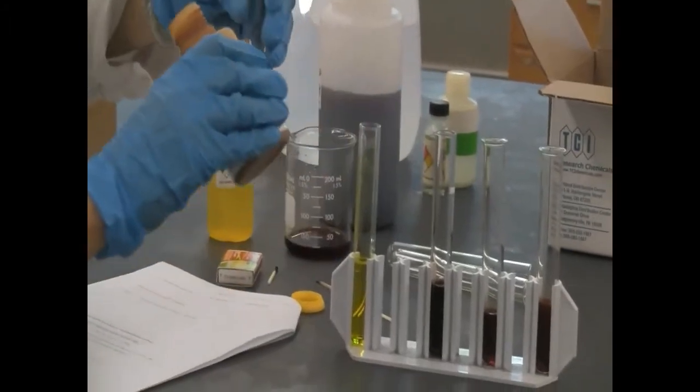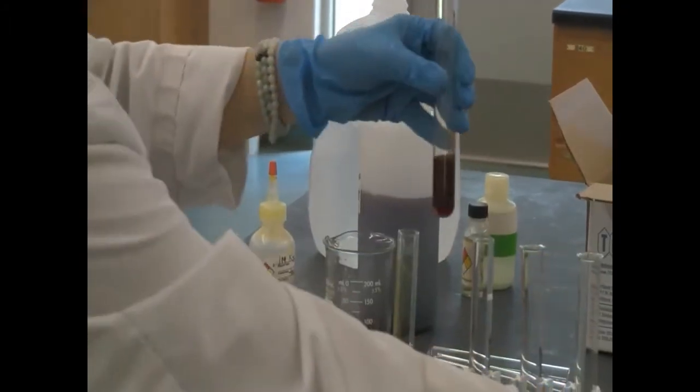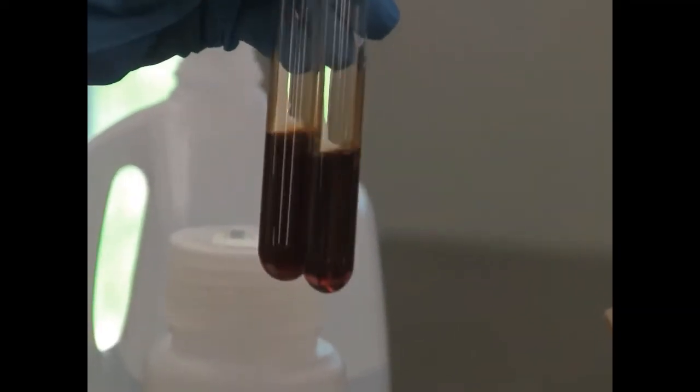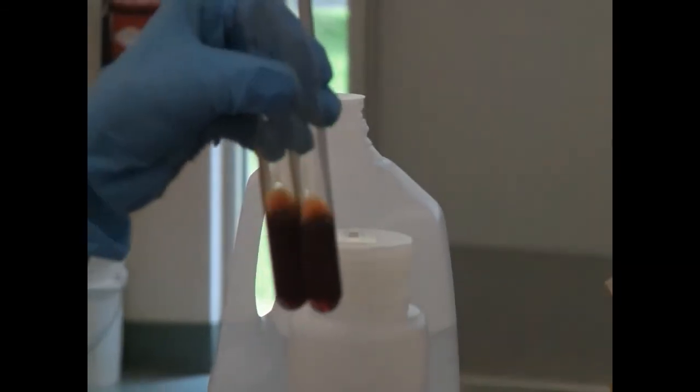So I'm going to add a little bit of iron chloride. Changed. It's almost the same color.